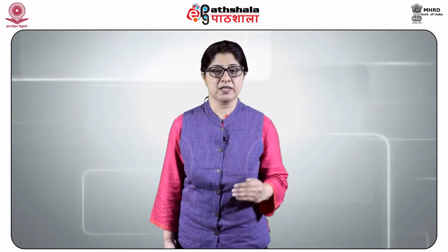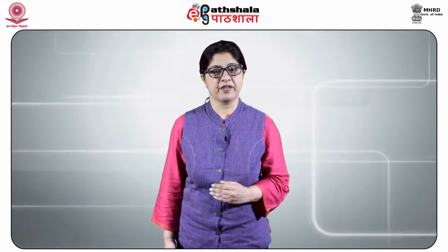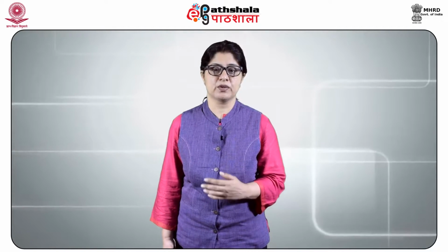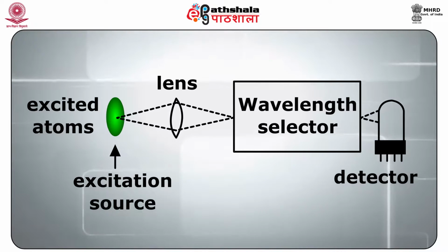The use of mirrors, properly placed, also eliminates the chromatic and the spherical aberrations encountered with the lens optics. At the exit slit of the spectrometer, the radiation is sensed by the photodetector. In older instruments, photographic film was used to record the spectra, but most modern systems use photomultiplier tubes or diode arrays linked directly to the computer-driven data processing systems. The given figure shows the instrumentation for atomic emission spectroscopy.